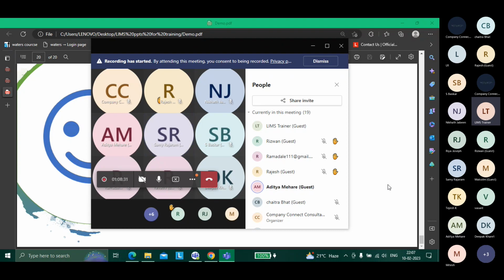Okay, interfacing. I can just tell you that this interfaces, this calls this, but that I can read from one SOP and give you the SOP. The point is, you need to know how the interfacing is done. For that, you need to open that code and see how they are using those remote function calls, which call is doing what.